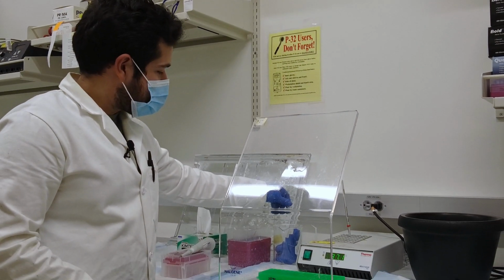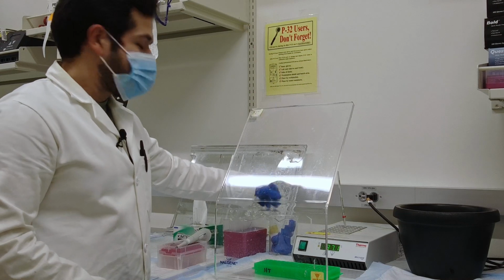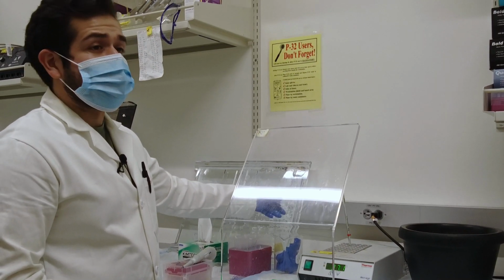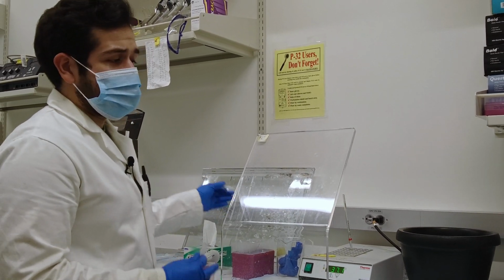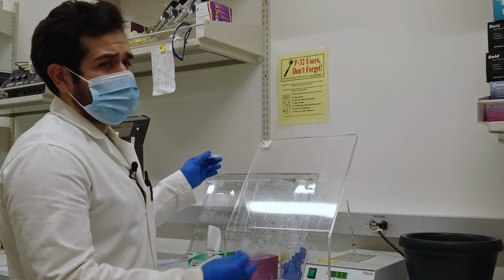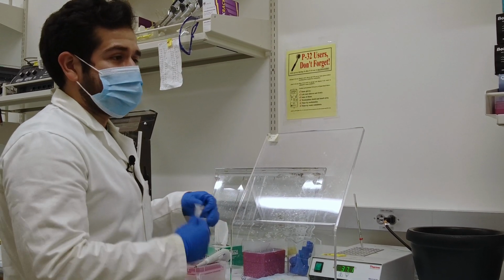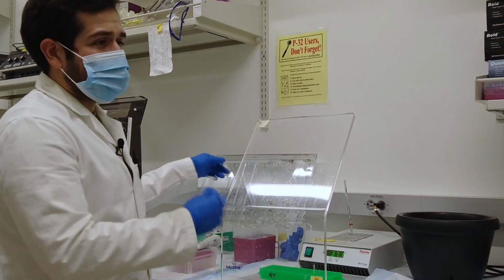into radioactive waste. You can put it into this beaker, which is marked for radioactive waste. This beaker is something that we use here just so whenever we have time and once it's full, we can actually throw it into the physical radioactive trash. This is just handy for us to have because, of course, it would be a really big hassle for us to keep constantly opening up the radioactive materials waste bin, when we can have something small like this and just keep it around to just throw things away.